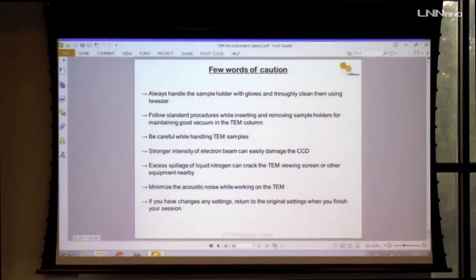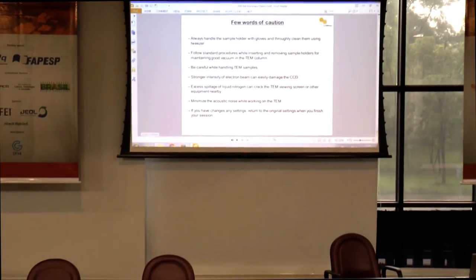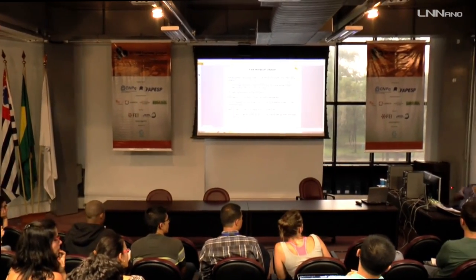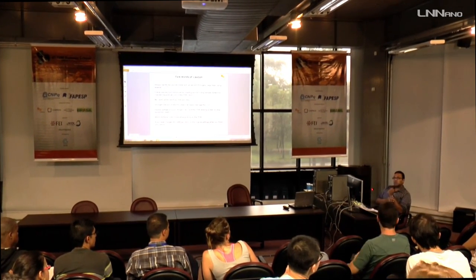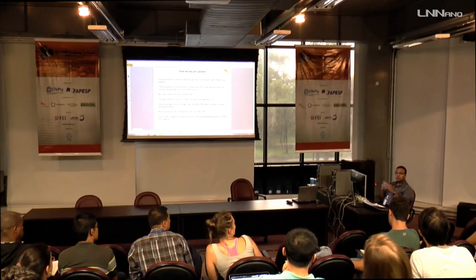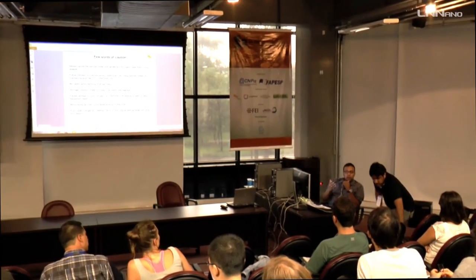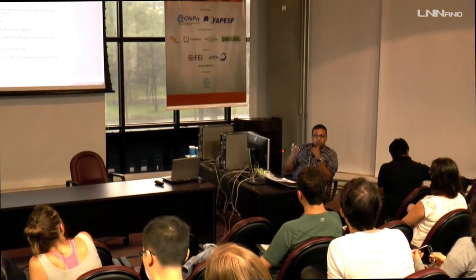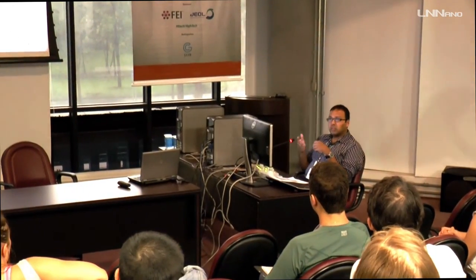Yeah, Obl is changing the excitation current in a particular lens. How it is done is that you're changing the excitation current, the current that flows into the lens. When you change the current, you're changing the electromagnetism, so you're changing the focal length. So Obl means you're changing the excitation current.